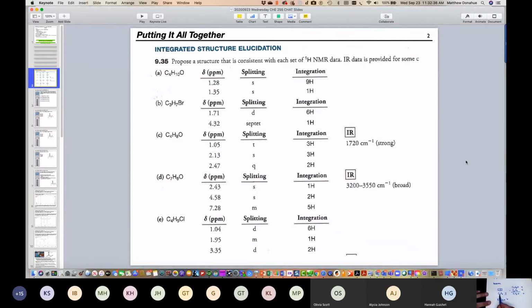So look at our benzene structure. There's 6 hydrogens in benzene. So if we sort of think that 1, 2, 3, 4, 5, then this could be a fragment. So there's 5, right? So our ratios of hydrogen integrations were 1 to 2 to 5. So this 5 could be that 5, right? So we'd have to sort of revise what we did here in a sense.